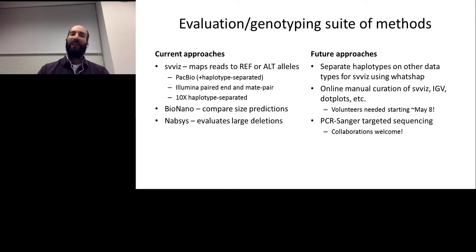We're also working on methods for doing targeted sequencing of these calls to evaluate them using, for example, PCR amplification and then Sanger sequencing. And if anyone is interested in helping with this, we're also really open to collaborations for that.